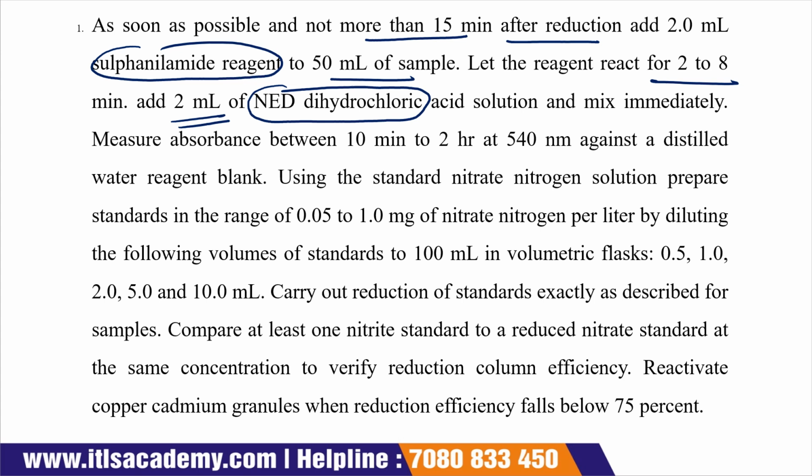Then after that, take the absorbance between 10 minutes to 2 hours at 540 nanometer. And you have to also take distilled water as a reagent blank.